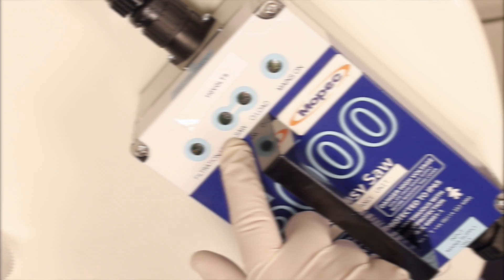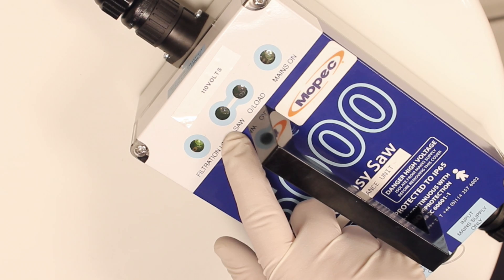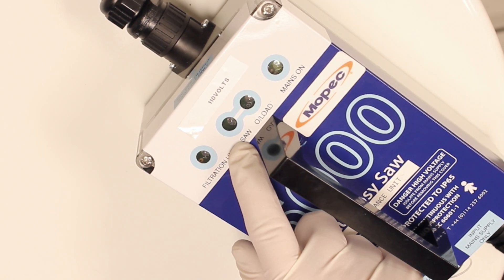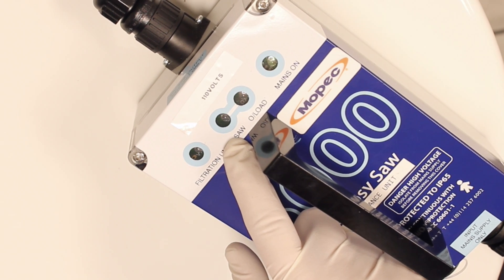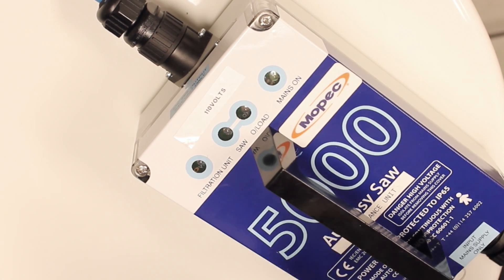The Mopec 5000 unit is connected to a portable power supply. If the saw is operating, the green indicator light will turn on with the filtration unit light. The filtration light shows that the power for an autopsy saw vacuum is available. The main power light will light up when your power unit is on.